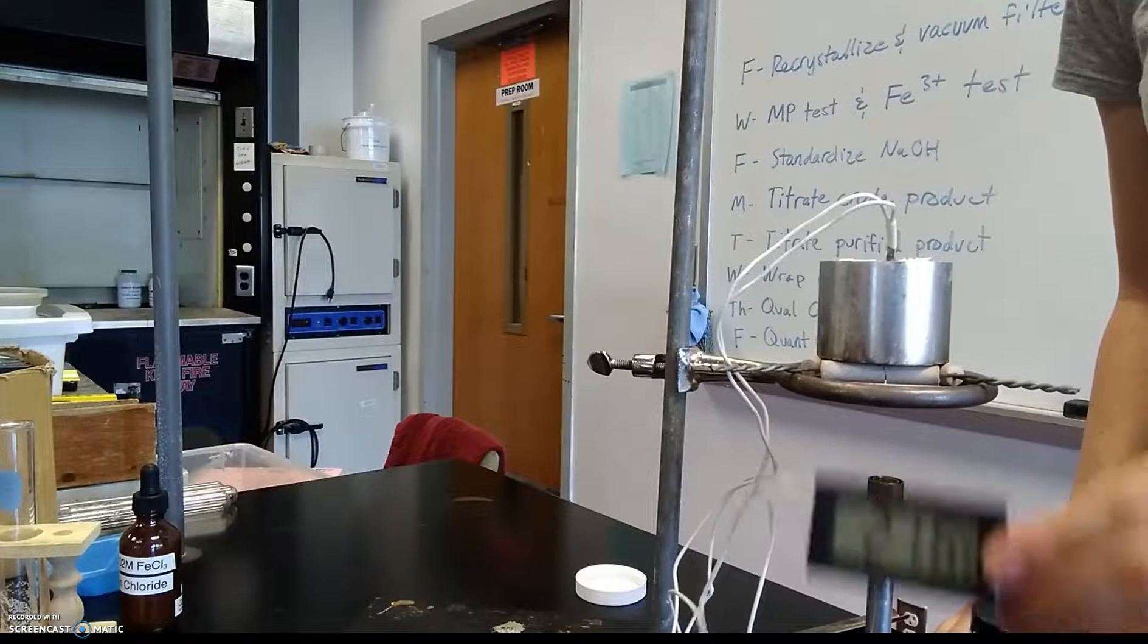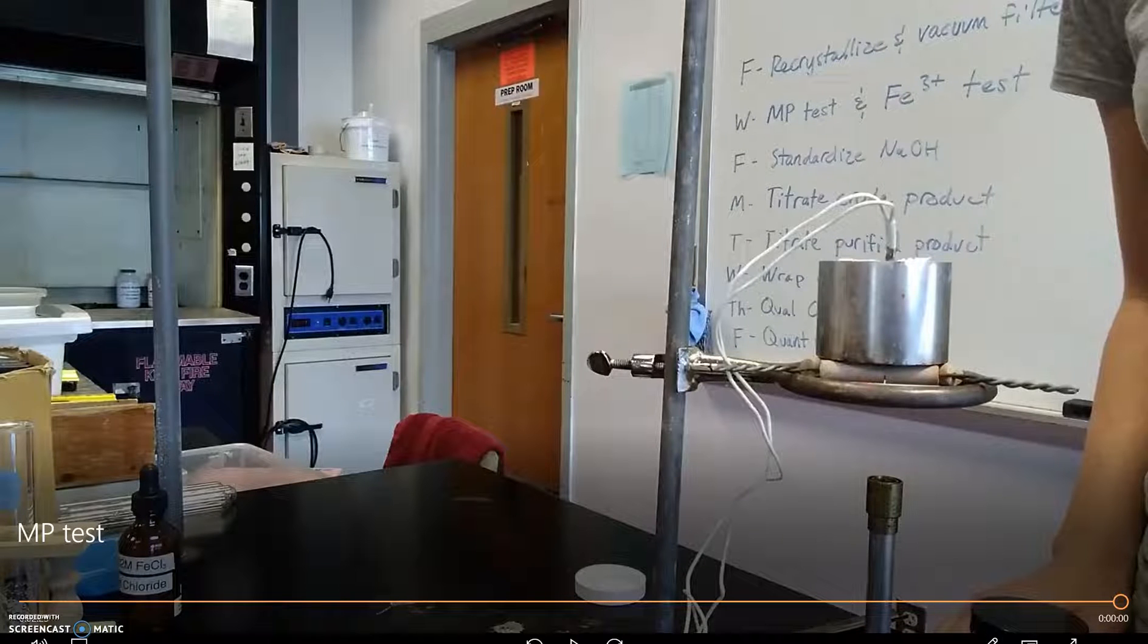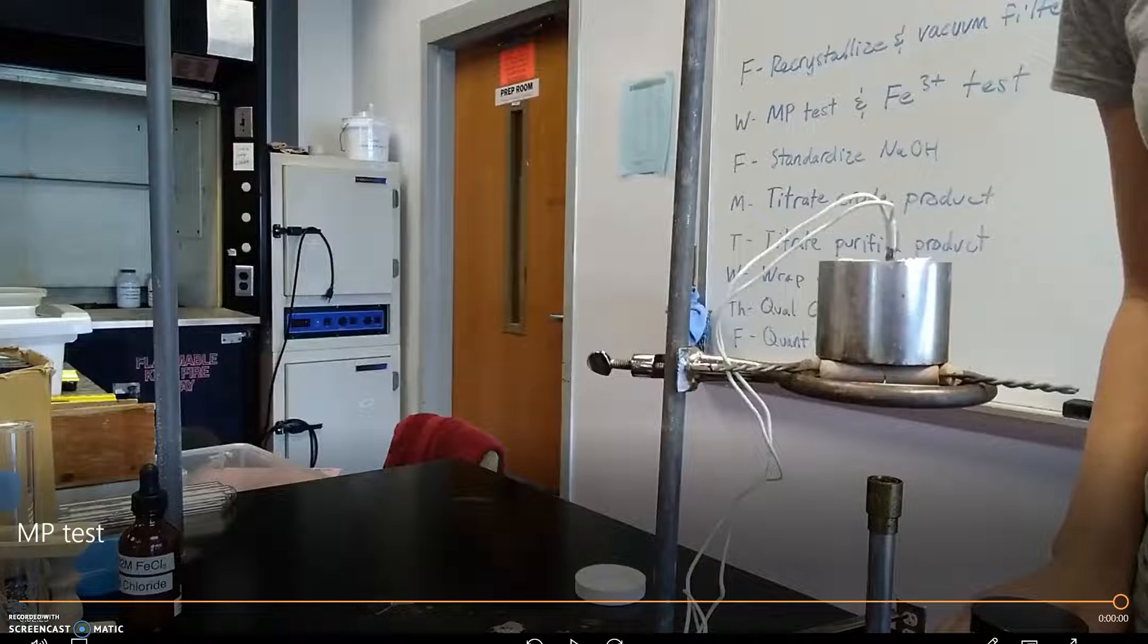And take all the digits that the electronic thermometer is giving you. We'll talk about the calculations in just a little while.